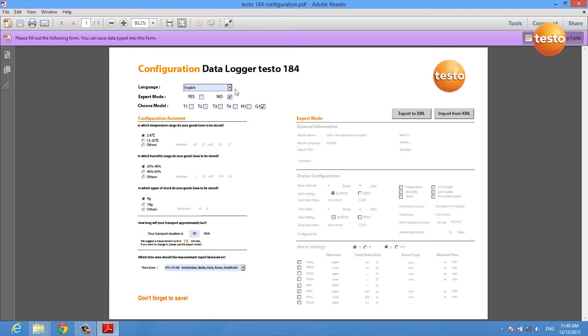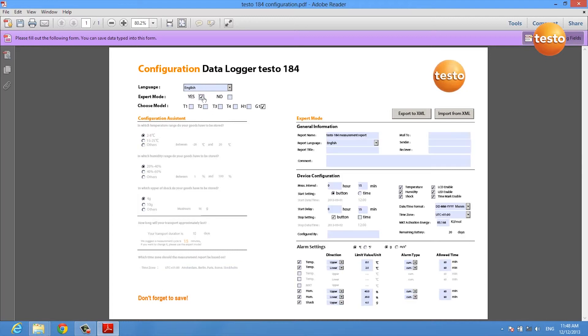You can select the language of your configuration, you can choose between an expert and an assistant mode, and you have to select the data logger model you are using.